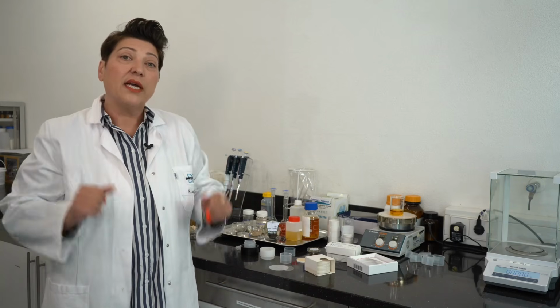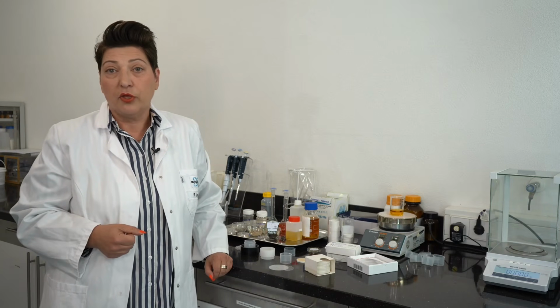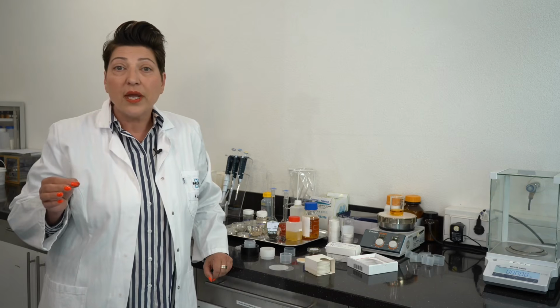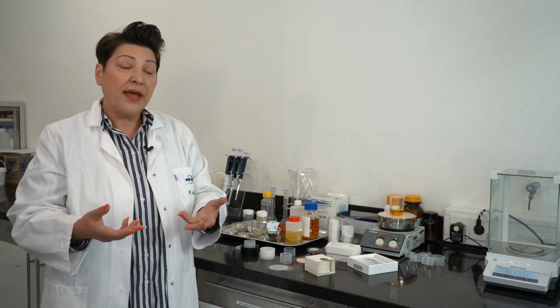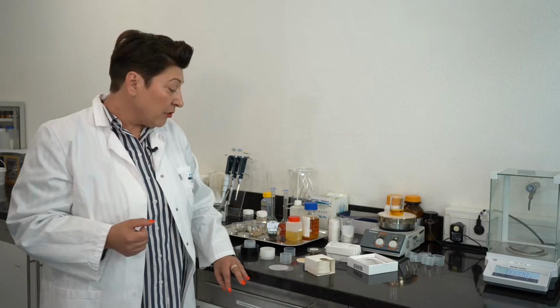But anyhow, you can also inform yourself on the homepages of the suppliers. Typically, they have a quite nice overview of the foils and the chemical resistance, or which foil can be used. There are different thicknesses available. It's always good to have a thickness which is easy to prepare, but also a thickness which is not absorbing too much light element intensity. So this is about the foils.